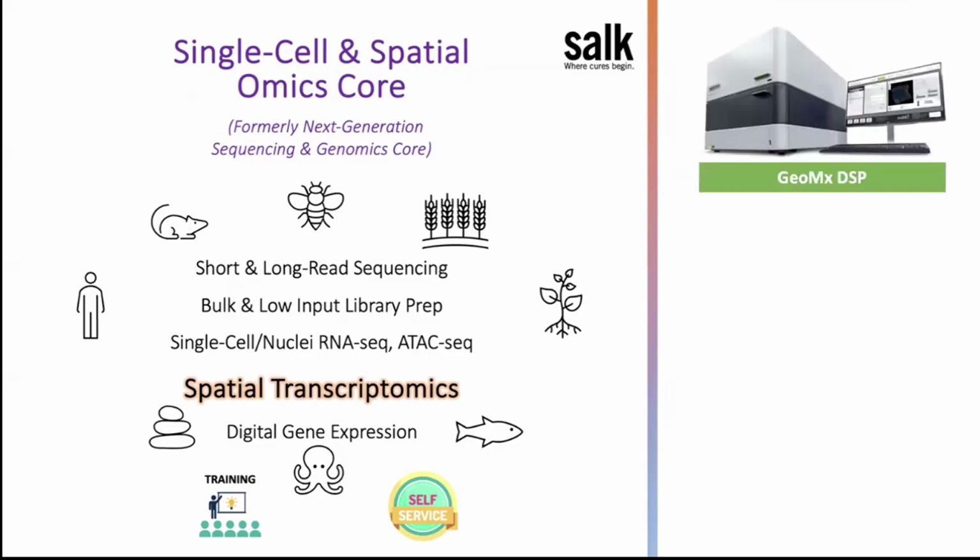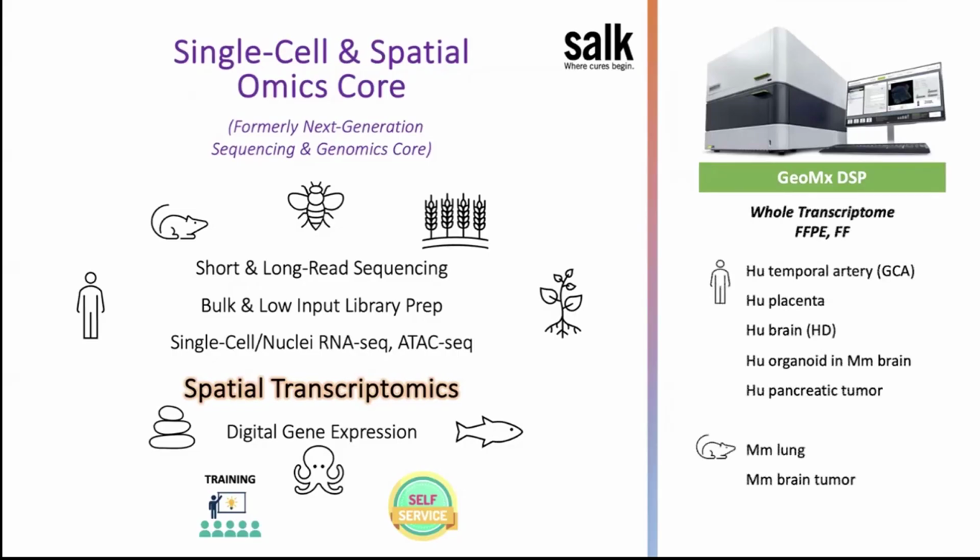Now let's talk about each of our spatial transcriptomics instruments: what we have done here at the core, what we have worked on, and what we liked and didn't like too much about each of these instruments. So let's start with the GeoMx DSP.